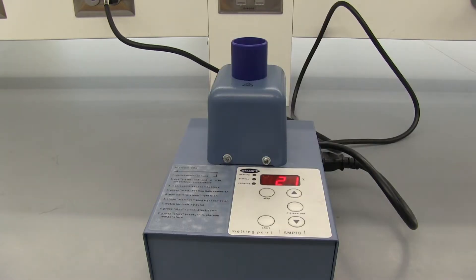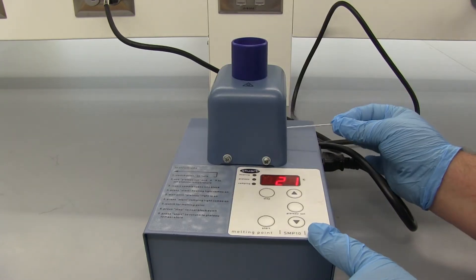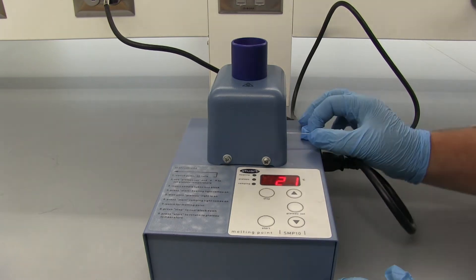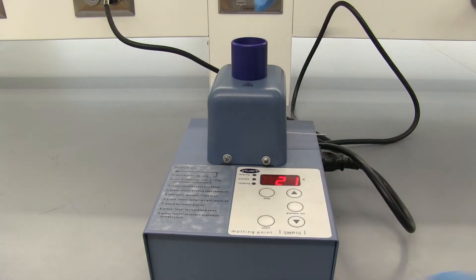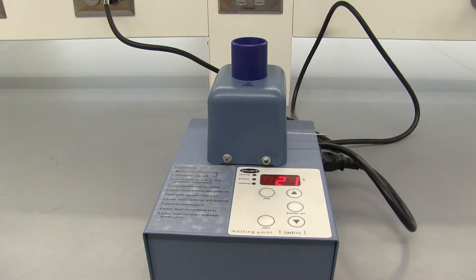We're going to put in our melting point tube and you'll be able to see it through the hole here. There'll be two grooves and a light that helps you see it. Look through the hole there.